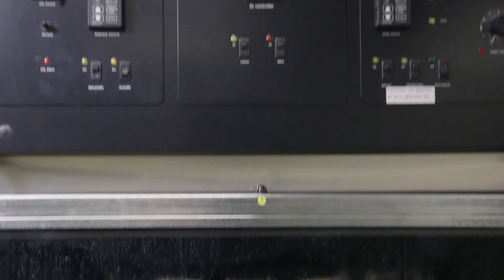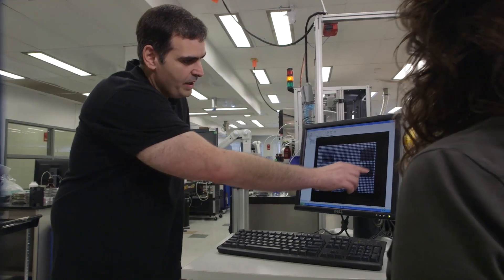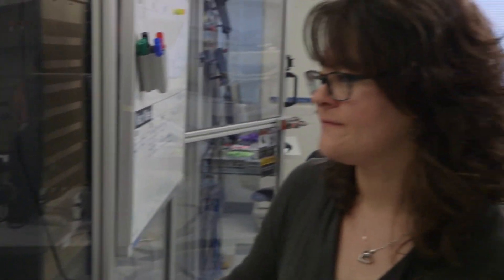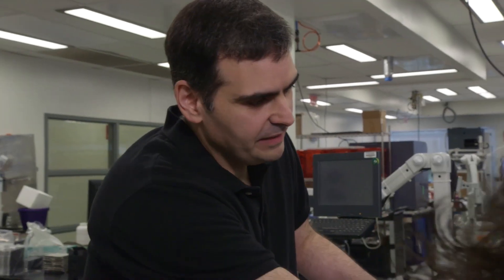The plates are incubated for a specific period to let the compounds affect the assay. Subsequently, they are transported to one of the plate readers. These are essentially highly sensitive cameras that detect whether or not those compounds altered the cell or protein in the desired way.